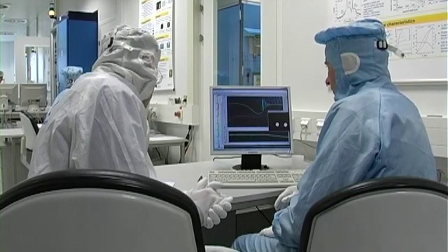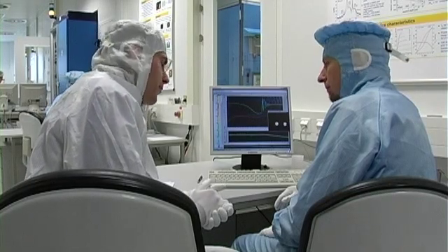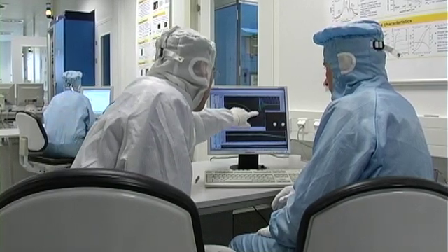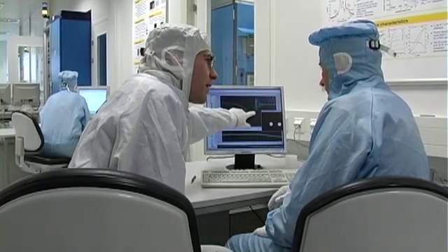So the real interesting part is what we actually see here on the LaTeX computer. For example here, the reflectance curve. We see a dramatic change here. What's happening there, Frank?